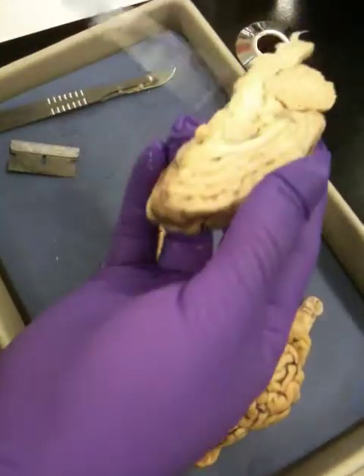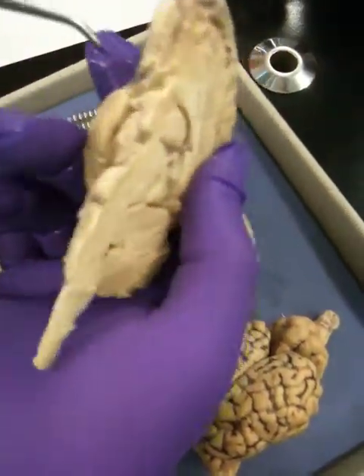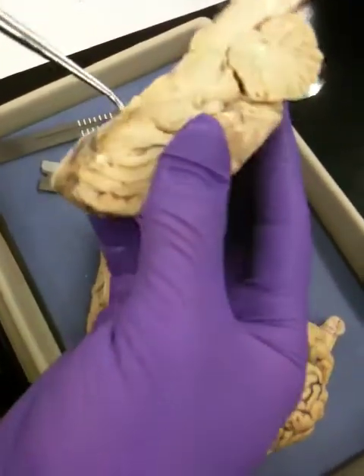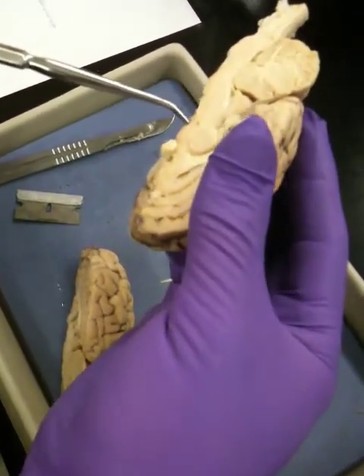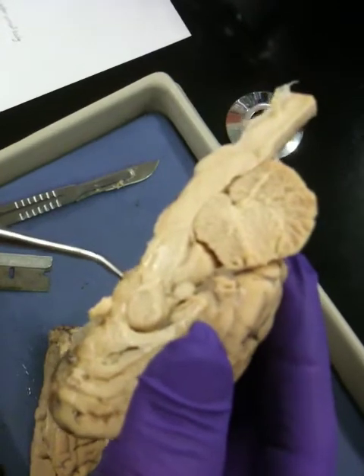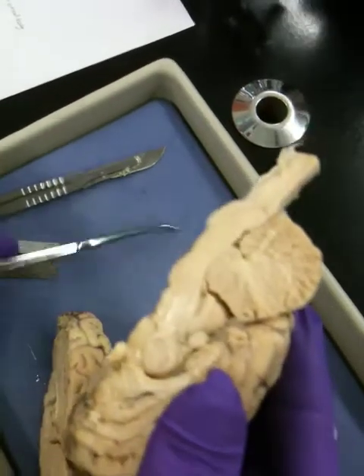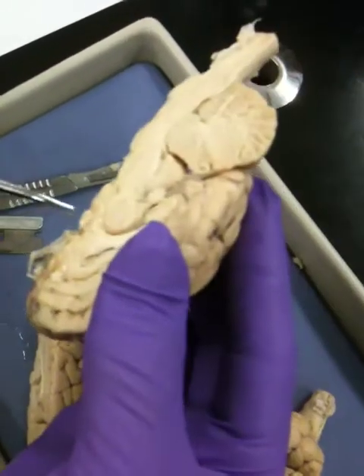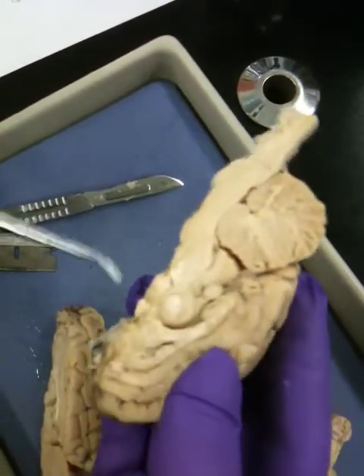So let's see what else. And then the mammillary body. So this is the optic chiasm. Actually, on this one you can see it better. This was the optic chiasm. Remember that? We cut it off. And the mammillary body is another white structure right here. It's tough to see, but in some of the brains it's pretty clear because the color is distinctly white. You can see it, but know the general location. See how it is different? You're going to see the mammillary body be that distinct in some brains. This one is not particularly.